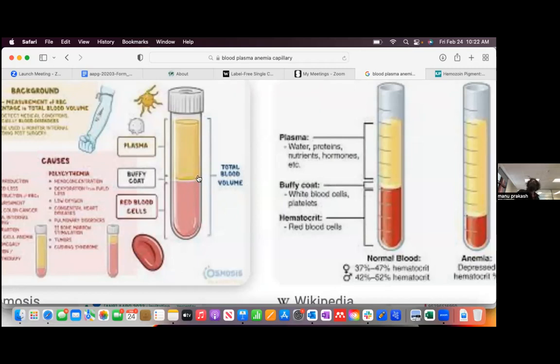And if I wanted to identify whether parasites were here, I needed some way of increasing the spatial resolution for it, because everything is piled up in this one tiny spot. So can you imagine a trick that allows you more resolution just in that region of density?